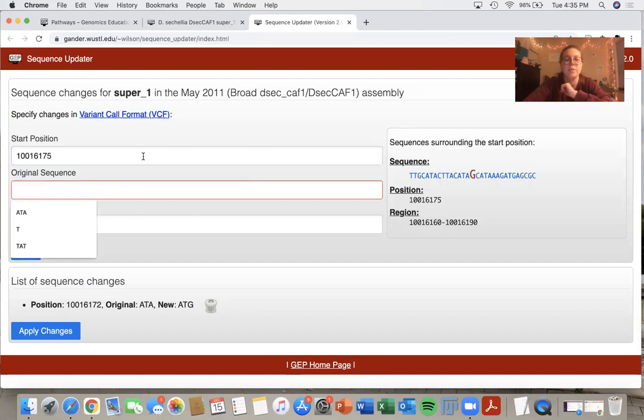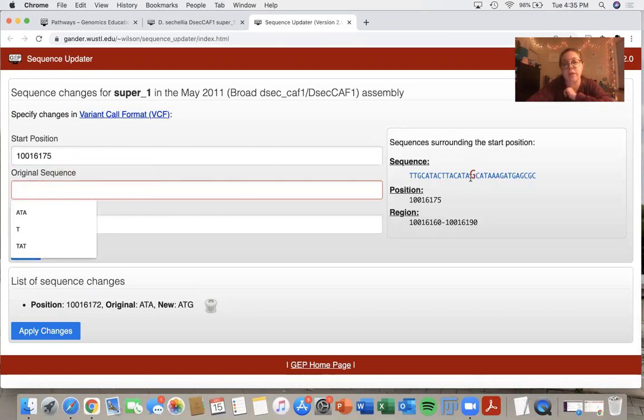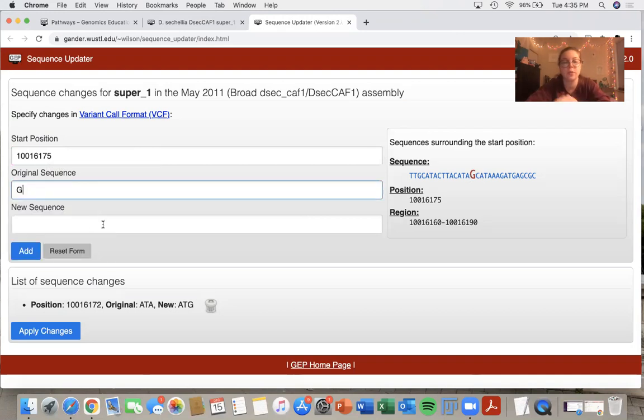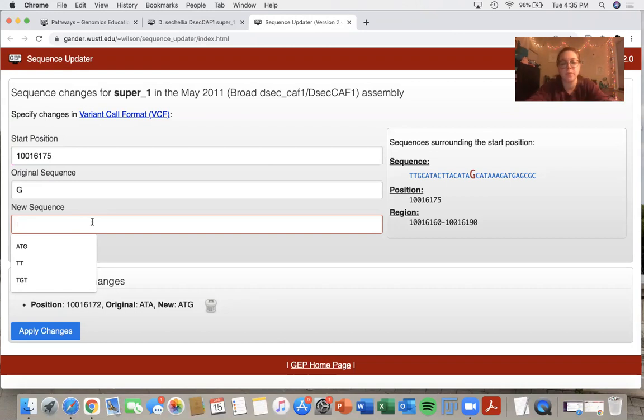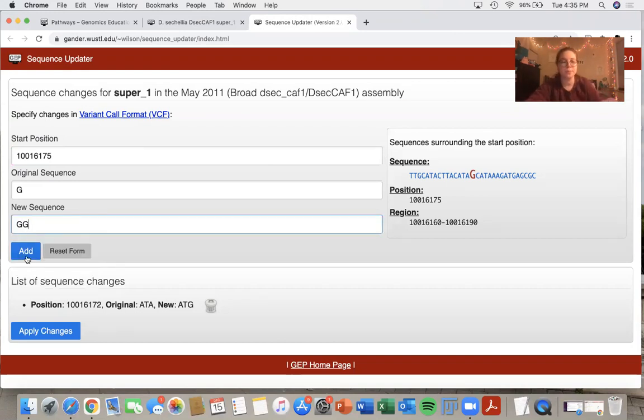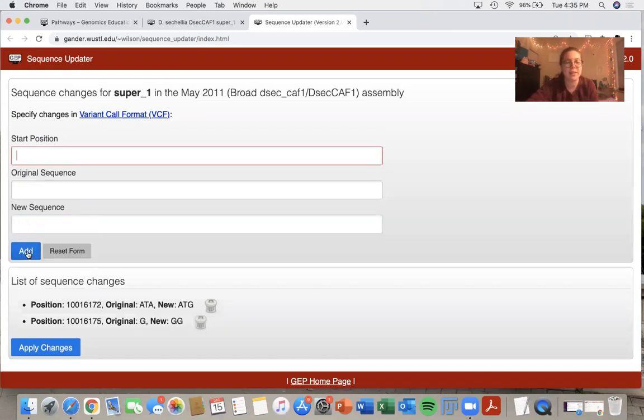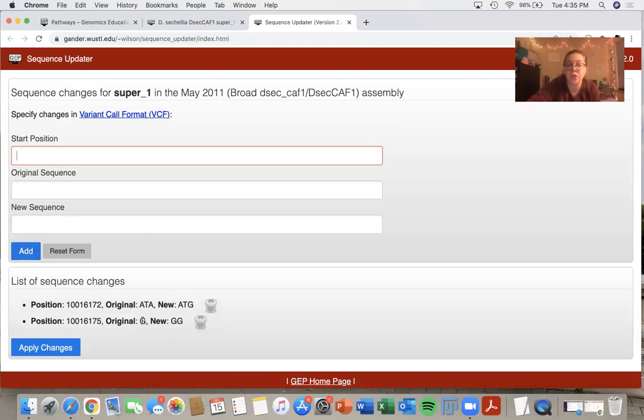And I can confirm at 10,016,175, I should have a G. So the original sequence is a G. And say I thought that there were actually supposed to be two Gs there. I would simply type in GG and add that. So that's an example of an insertion. Originally I have one G, now I have two Gs.